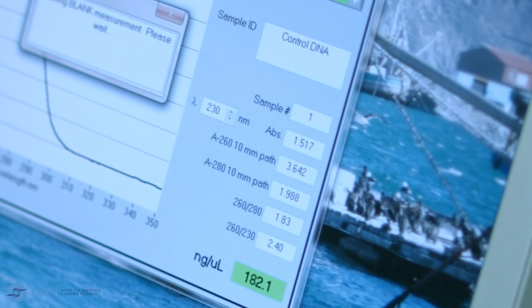The plate will remain in the PCR hood or the laminar flow until the samples have dried down completely. The drying time will depend on the volume of DNA used.